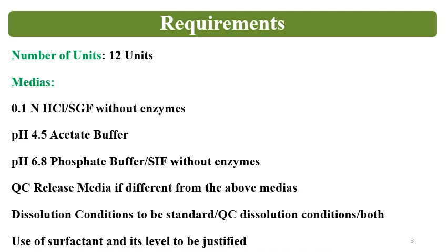QC dissolution conditions are generally used for this multimedia dissolution or comparative dissolution. But for some formulations or products, the standard dissolution conditions are required. Sometimes the regulatory authorities ask for data on standard dissolution conditions and also on the dissolution conditions used for the QC release.